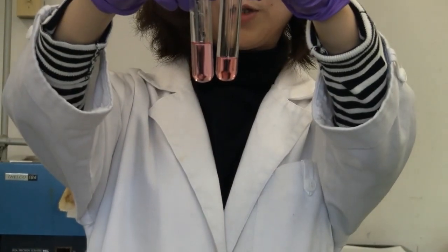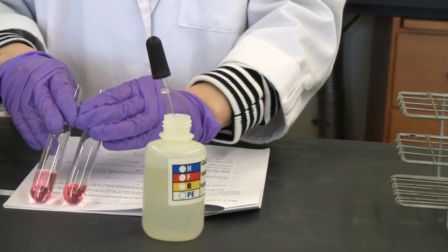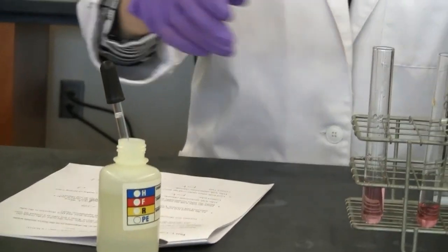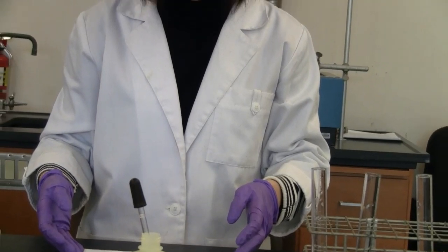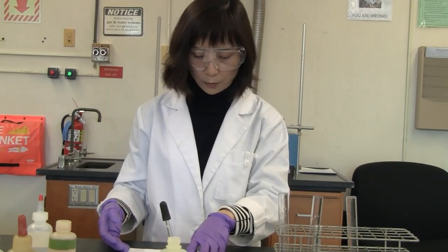Okay, it looks like it still is the original color. It's against the white. Still, right? Same color? Maybe, let's see, no, same color. Okay, remember you add the concentrated hydrochloric acid into it. Okay. Now, to the second test tube, move to step 3.